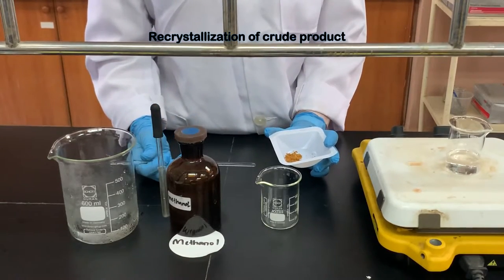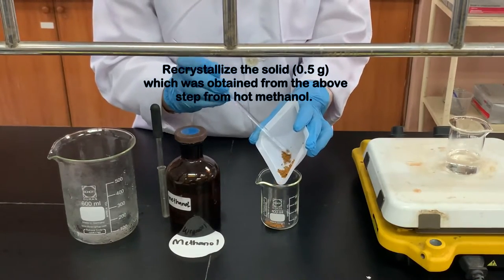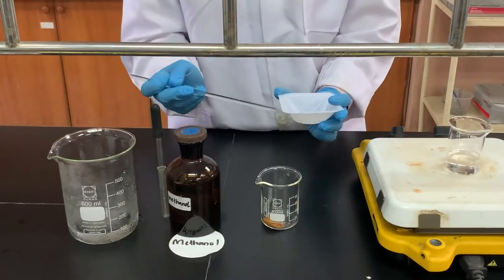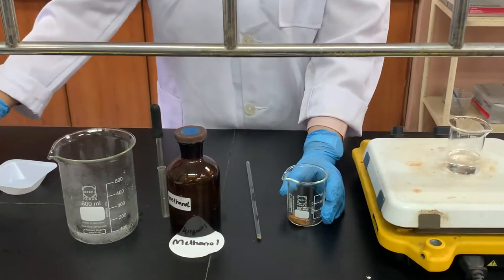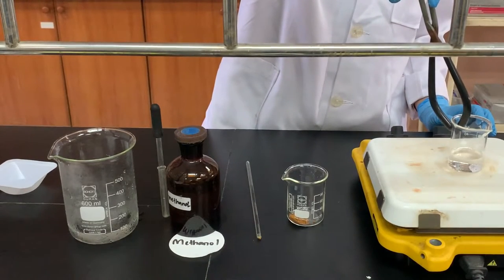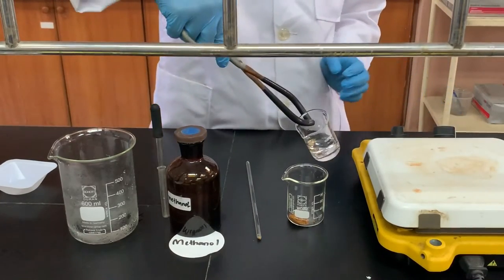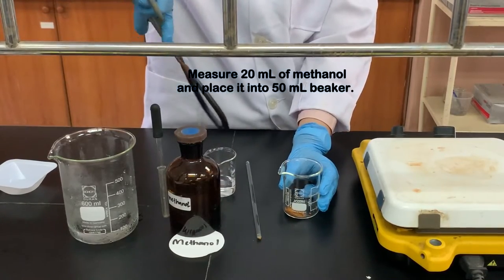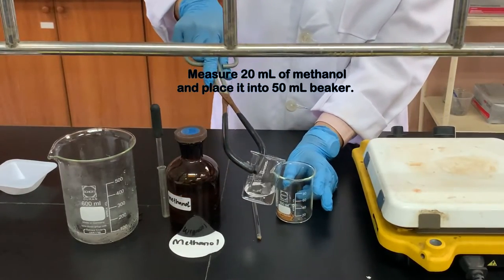Next step is recrystallization of the crude product. We recrystallize the 0.5 gram solid obtained from the above step from hot methanol. Measure 20 ml of methanol and place it into a 50 ml beaker.